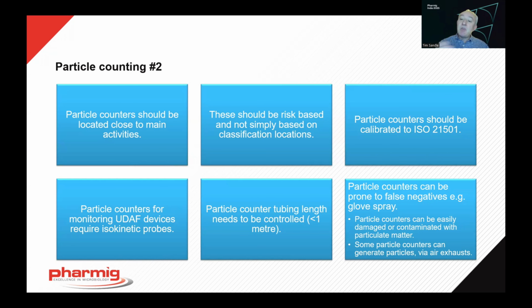A lot of this is captured in the new part of ISO 14644 that was issued last year, part 21, as well as taking into account the calibration requirements contained in ISO 21501, part 4. So, important things there. And also to try and avoid contaminating the particle counter, so not spraying glove spray too close, and things like that.